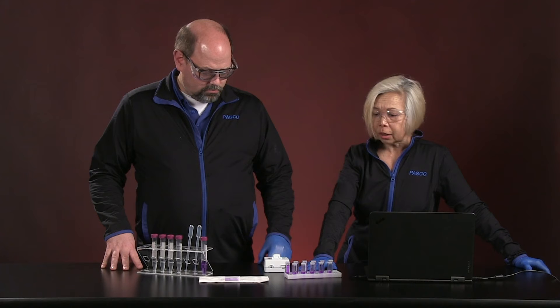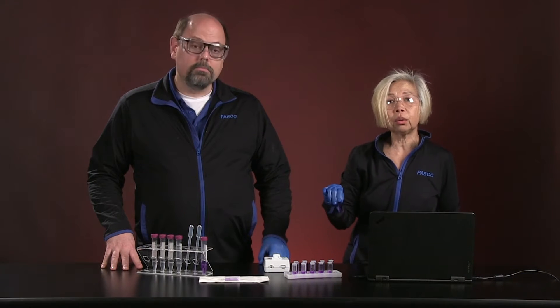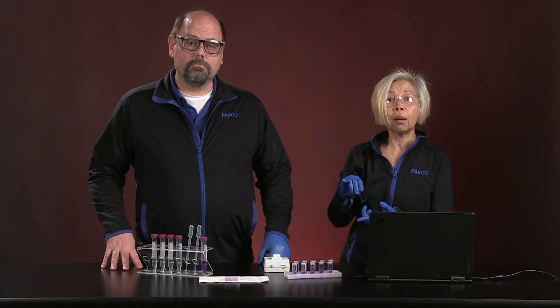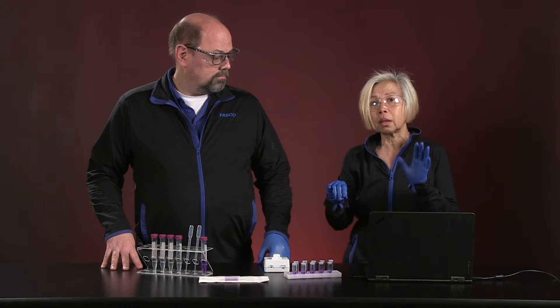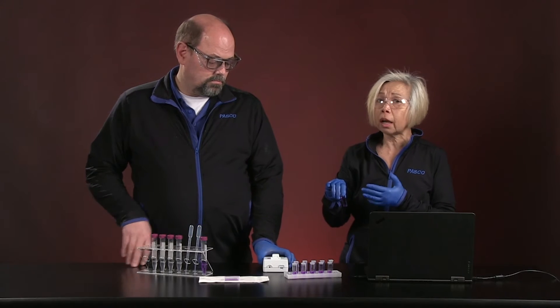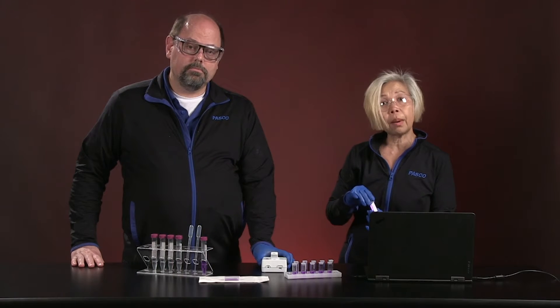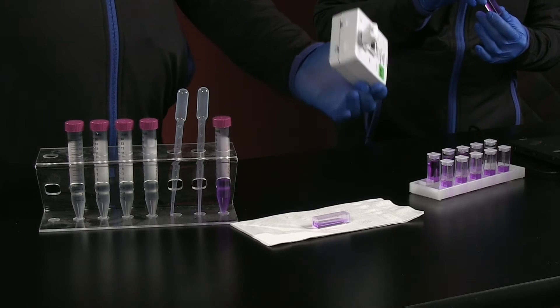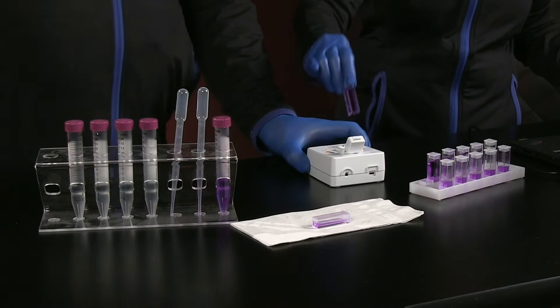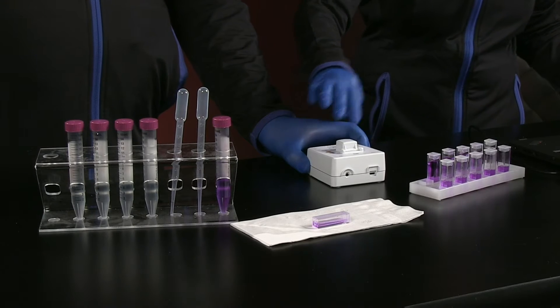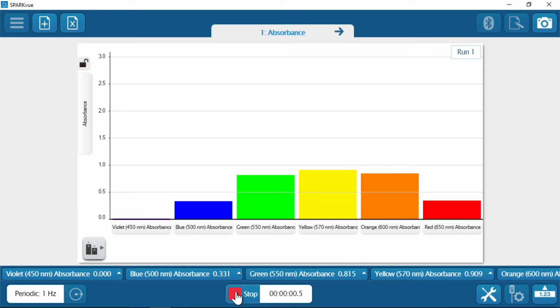Cool. So, let's get started today. Crystal violet. The first thing that we have to do whenever we do any kind of spectrometer or colorimeter studies is to figure out what the appropriate wavelength is that the dye will absorb in. Because after all, you don't want to be reading at the wrong wavelength. So, we are using a PASCO colorimeter, a wireless colorimeter. Very easy to use.